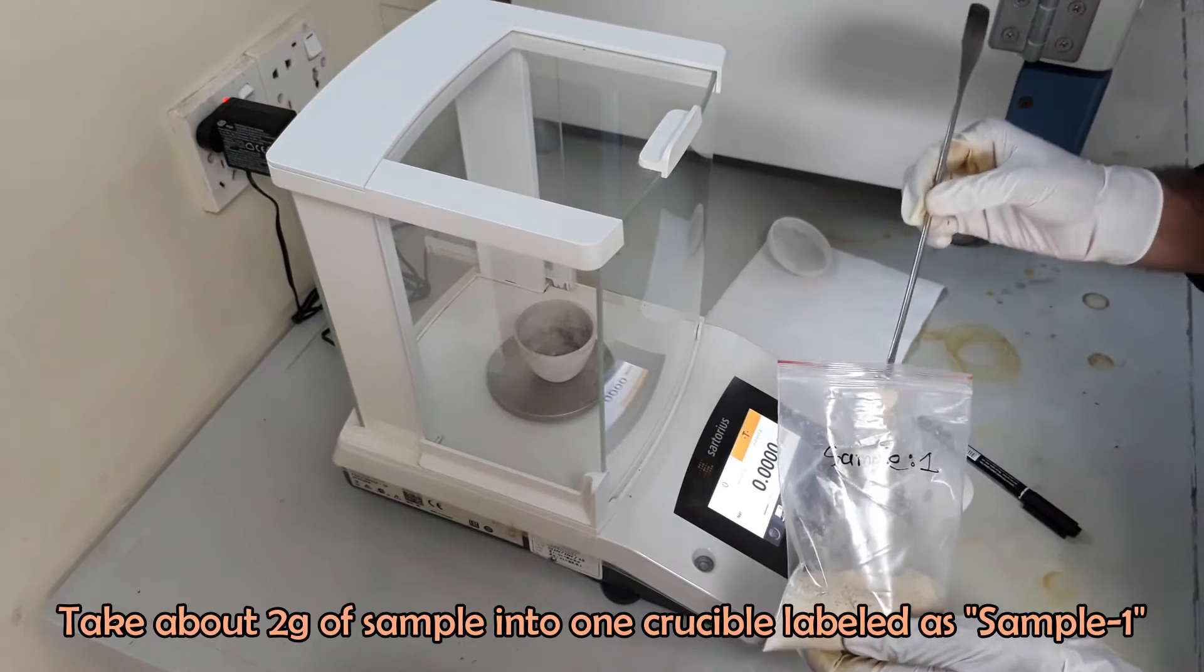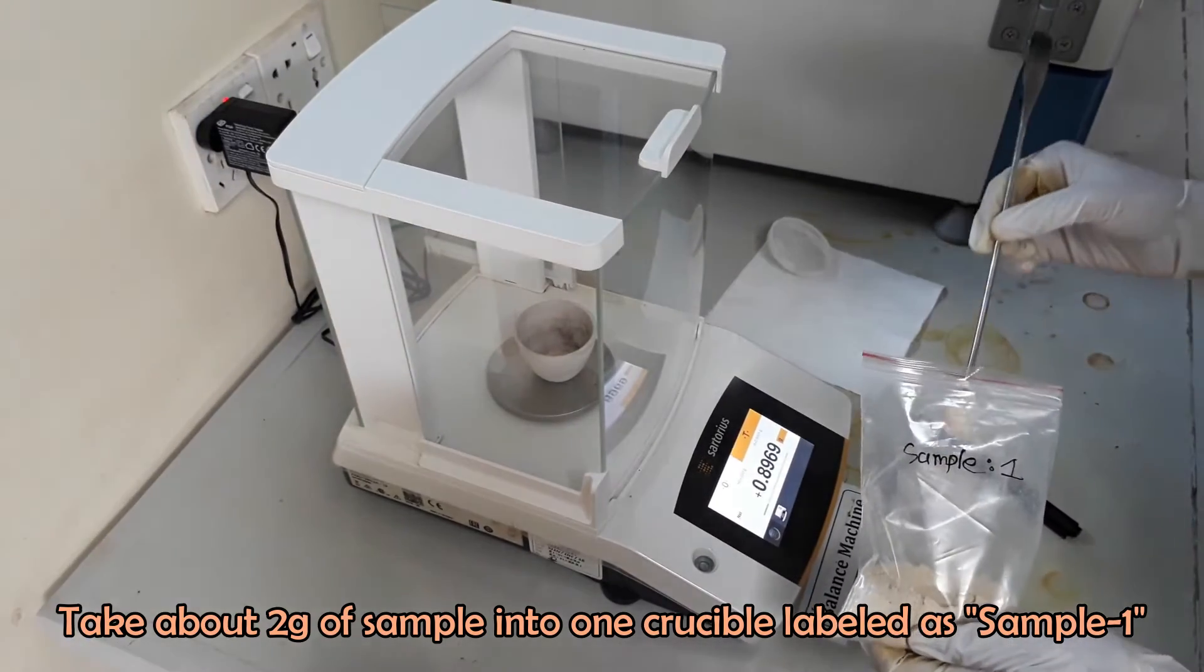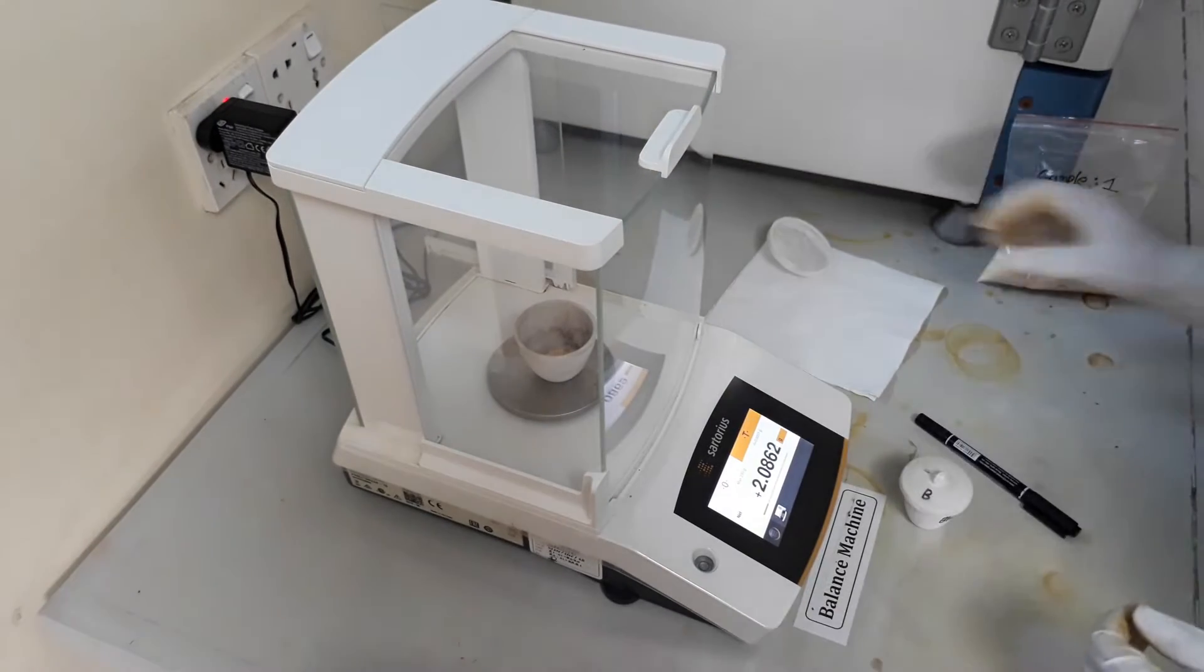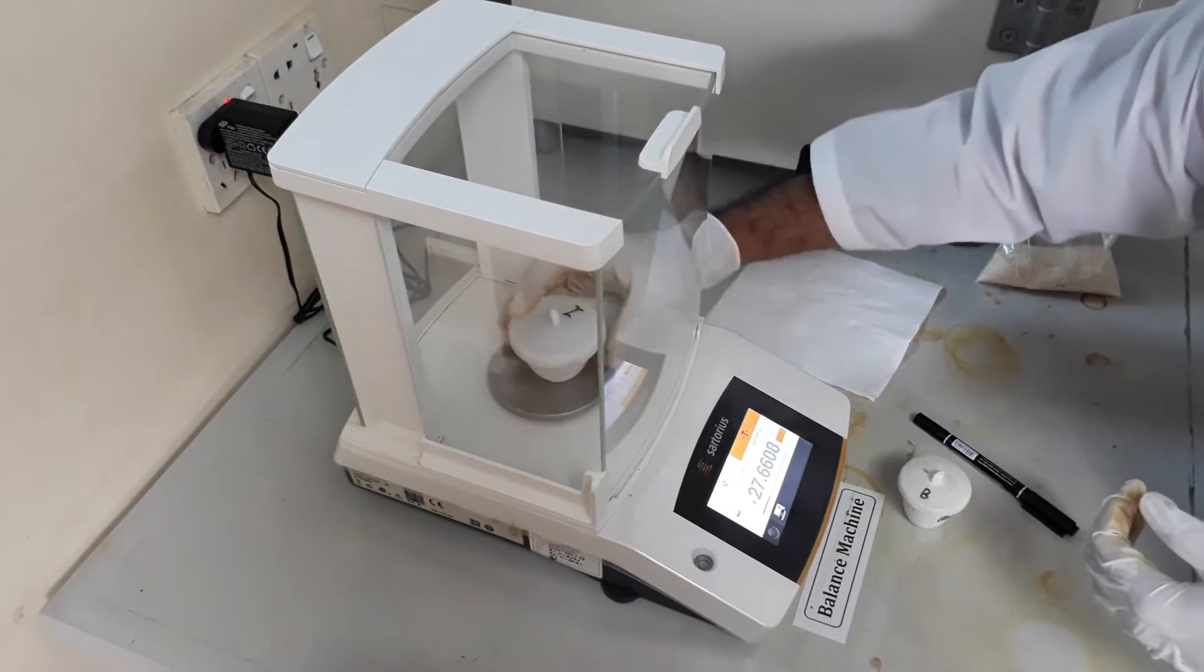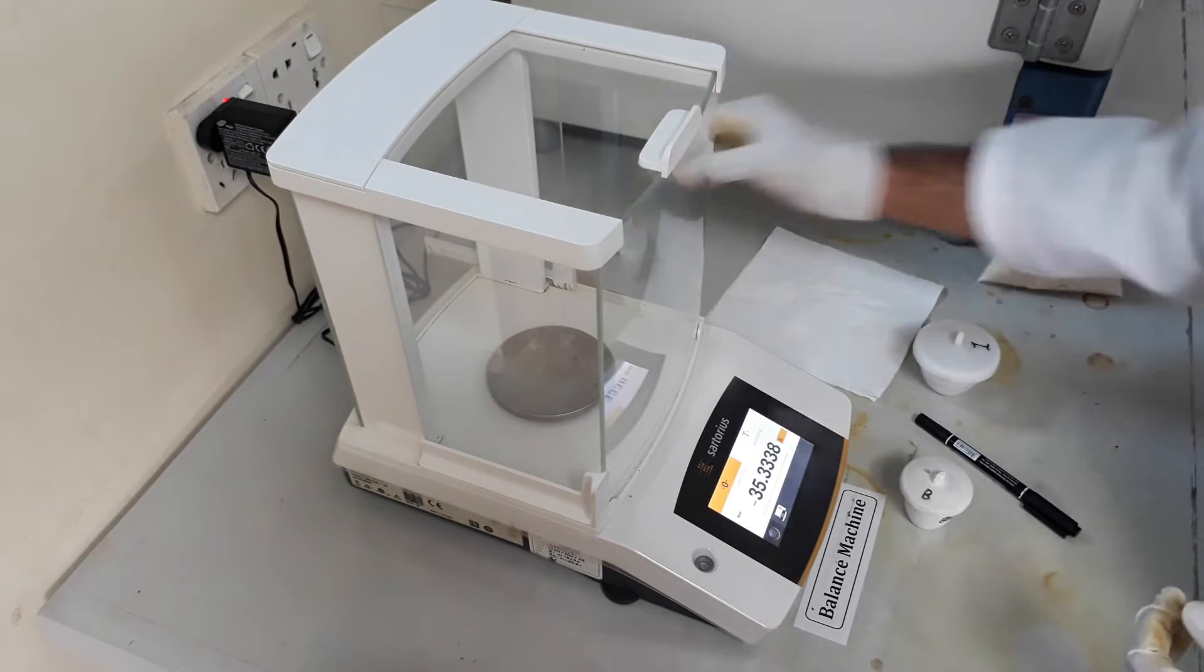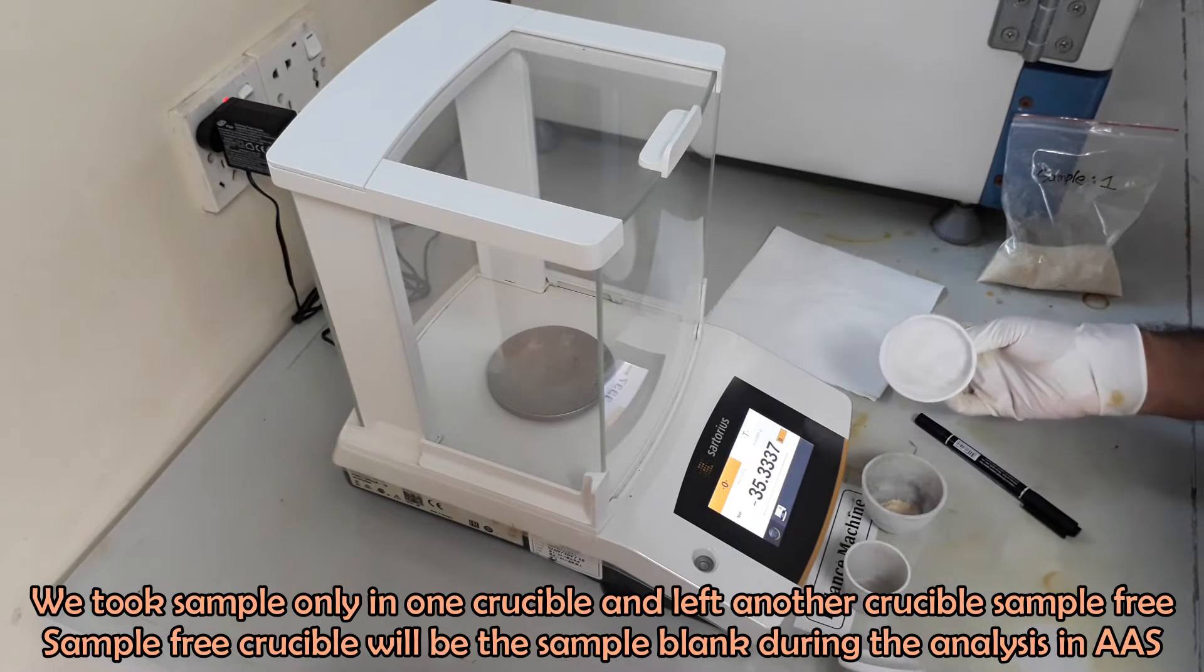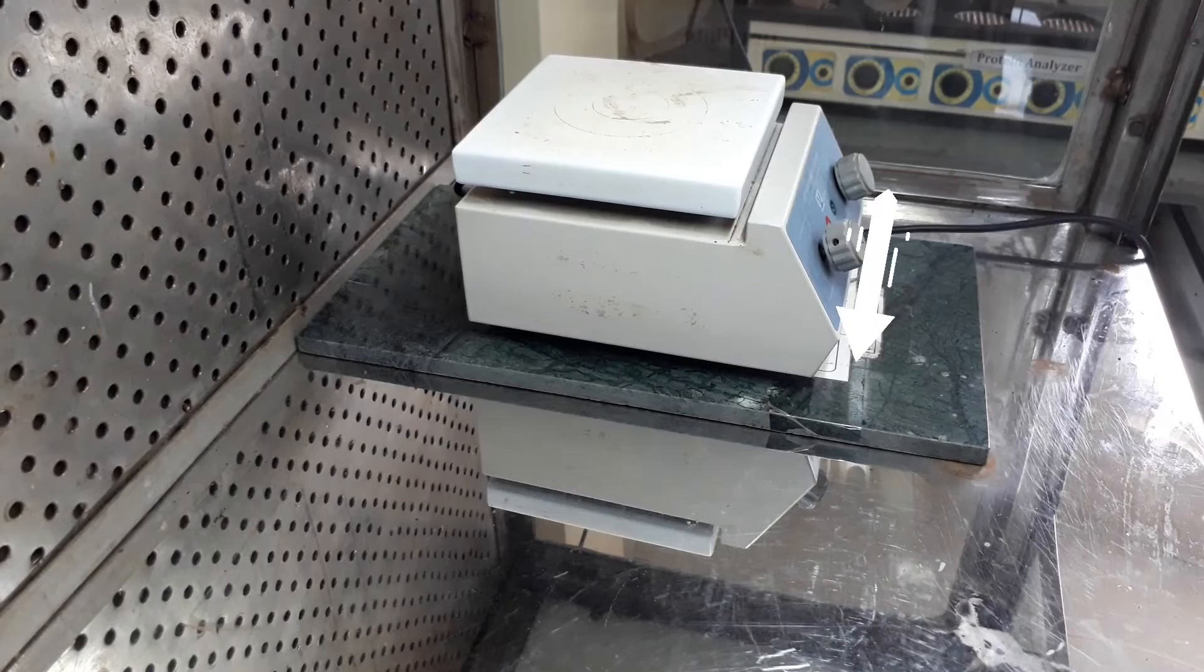Take about 2 grams of sample in a crucible labeled with sample ID. Cover the crucible immediately with its lid. We took sample in one crucible keeping another crucible left blank. Sample blank will be prepared in this blank crucible following every step for the sample preparation except taking sample in it.